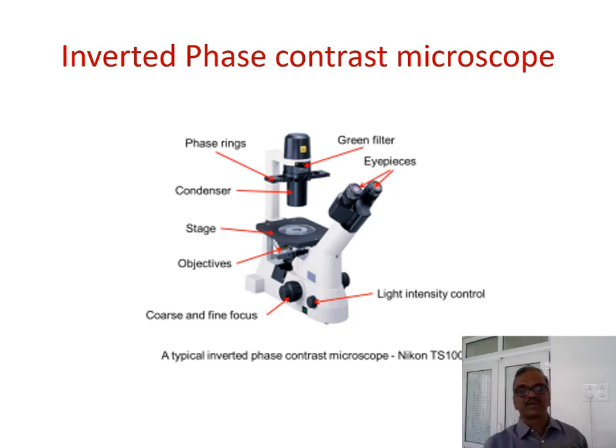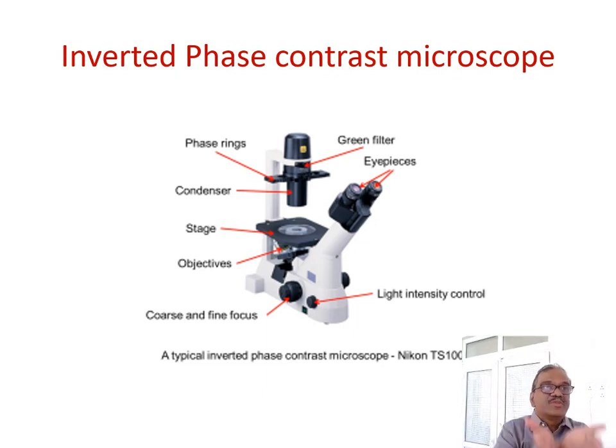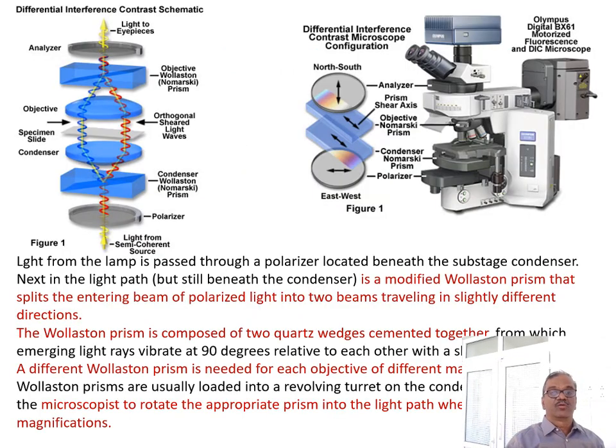So that is the inverted microscope, and in that you can see a phase plate. To show the phase plate only, they are keeping it like this. This is a phase plate, you can adjust it. There is a ring-like structure, and through the rings the light is passed, and it may be of different kinds, so that it makes the contrast possible. So with the help of the phase plate they are making different images of different thickness. Then there is another one with the same contrast concept.